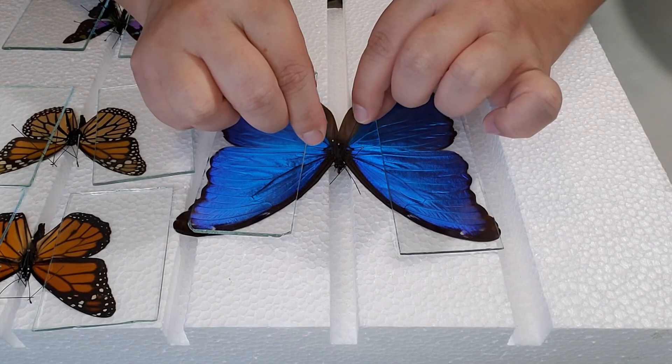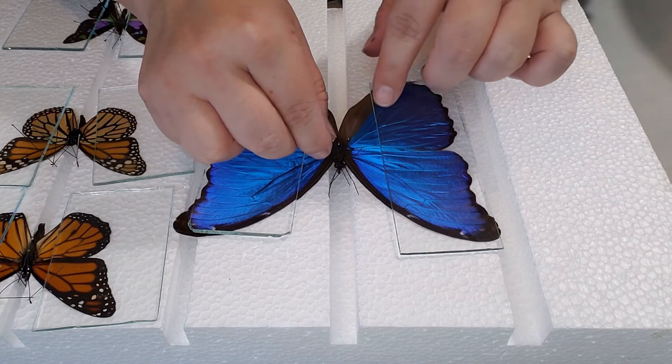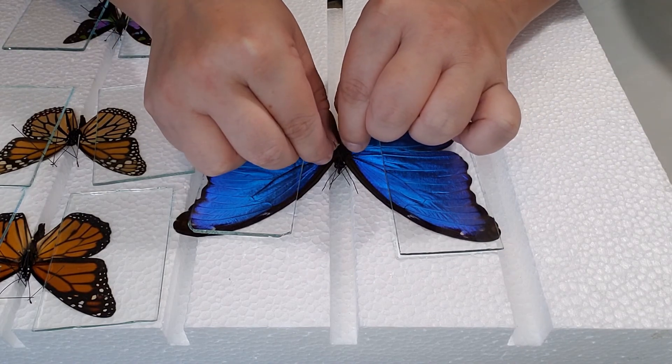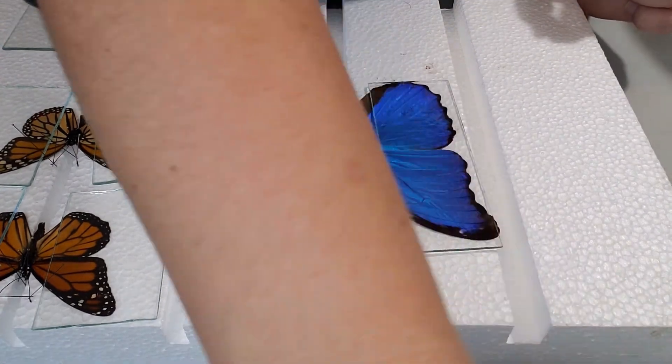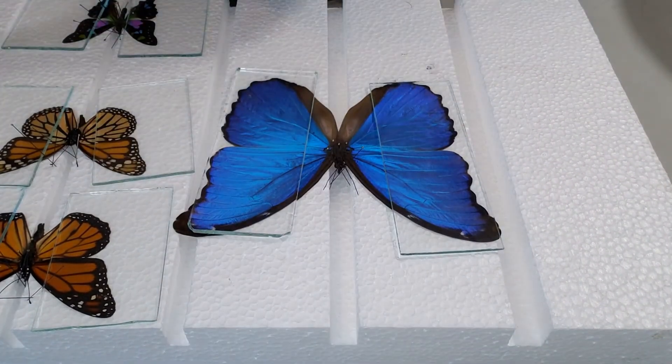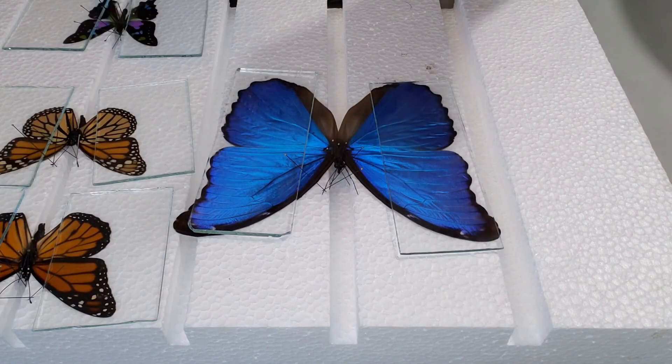Then you can go ahead and start securing the antennae using the cross method, just kind of finagling until you get them straight. You have to feel it out depending on the antennae that you have and whether they're curly or not.